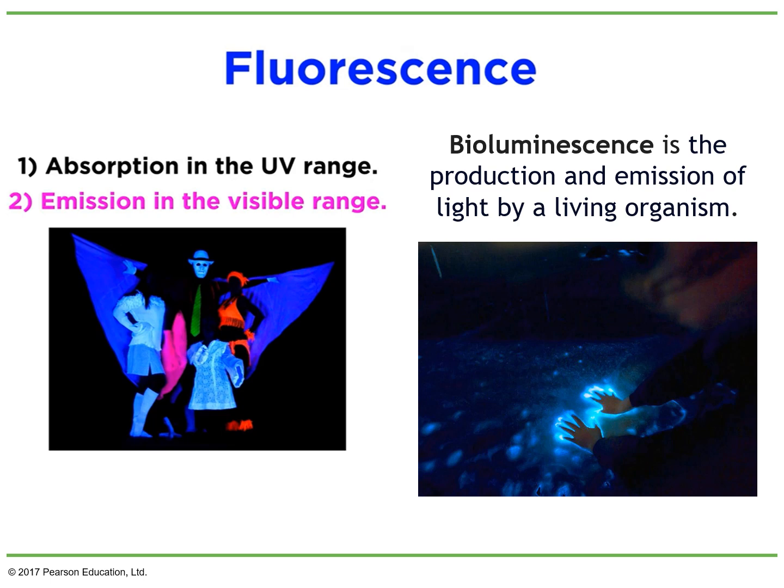Right now, I just want you to see two different sources of fluorescence. One here, these people at a party, for some reason, we don't know why, you see that their clothes are fluorescent. And in the following slide, I will show you that these clothes are absorbing wavelengths, in this case in the UV range, and they are also emitting. There's an emission of this fluorescent light that appears in those clothes.